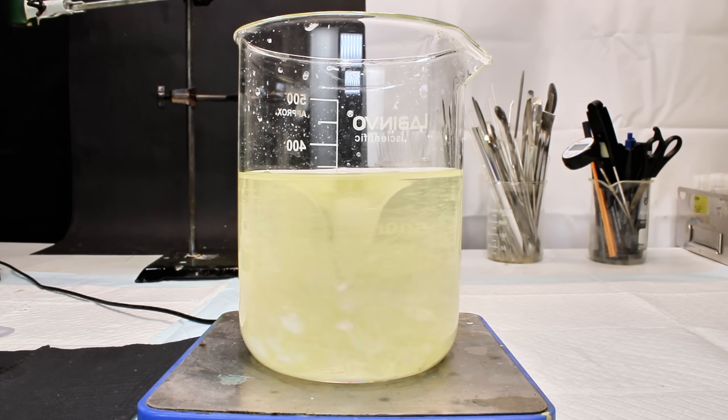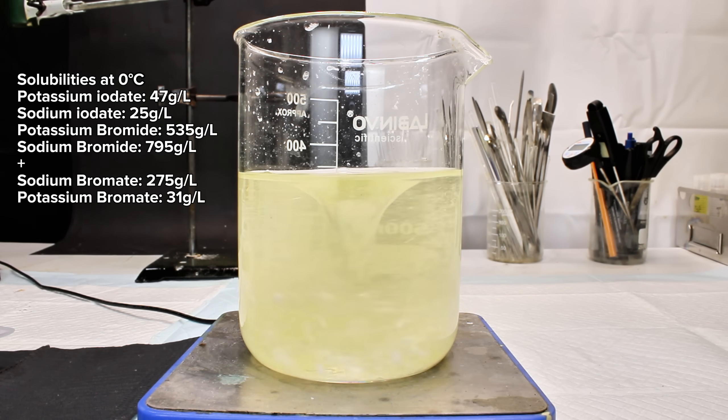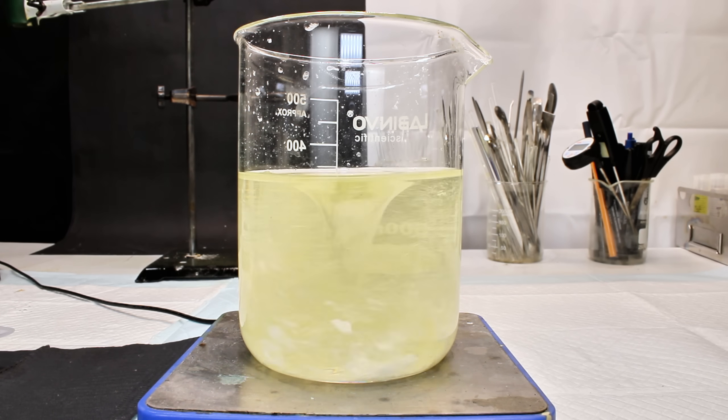This consequently means that my percent yield is even higher than the initial 108%, meaning this is very impure. My working theory on this impurity is that there was a significant amount of unreacted bromate which precipitated as its potassium salt. This means I needed to figure out some way to convert my sodium iodate to potassium iodate while also getting rid of my bromate impurities, and I think you'll like what I came up with.